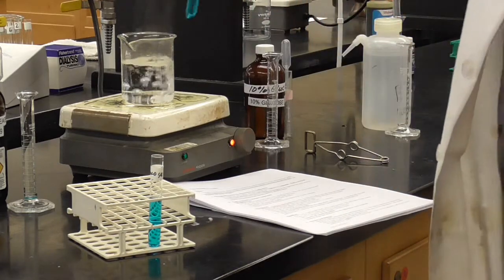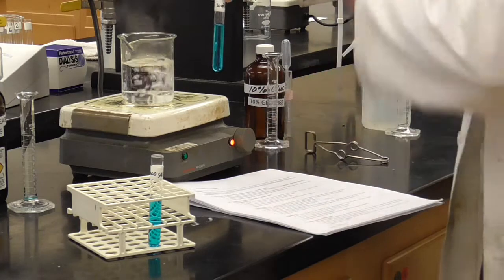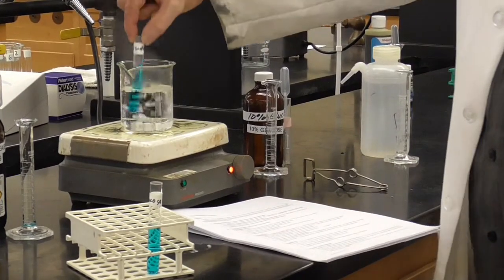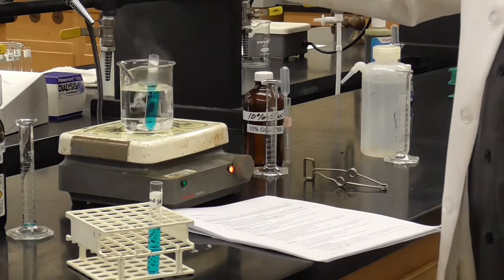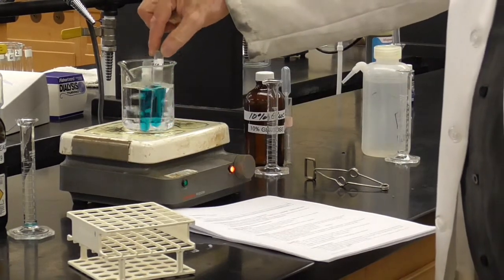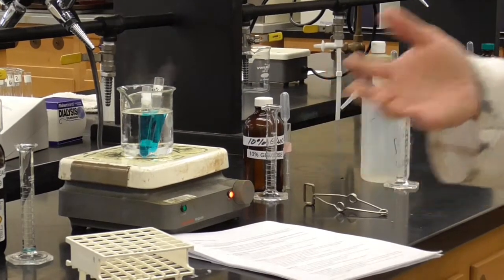I want to make sure I've got about the right amount of water in there. I want it to be heated, but I don't want it so much that the water is going to splash up and get into the test tube. I think we're looking pretty good. So there's the negative one, and there's the positive one. Put those two in there. And now we give them 3 to 5 minutes.